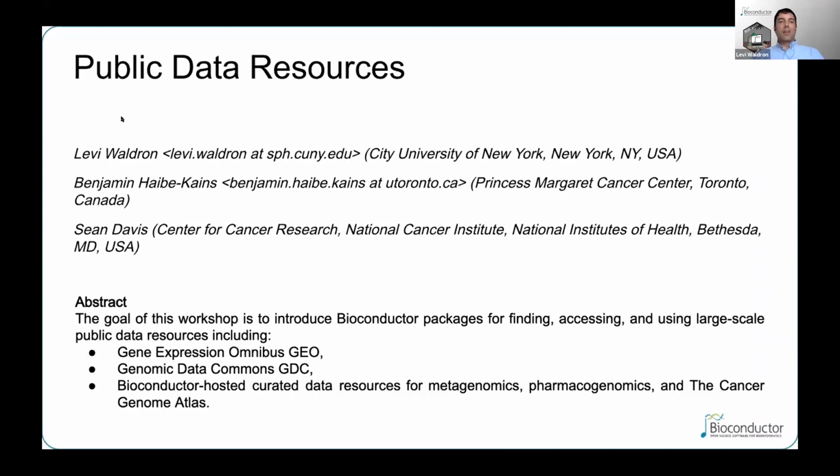Okay, so this is going to be a brief overview of public data resources in Bioconductor. Now, there are many of these, so this necessarily involves a bit of curation and selection on our part. But I think we're showing not only the work that has come from ourselves, but some additional things based on some of the most widely used and long-standing and stable and we think usable resources in Bioconductor.